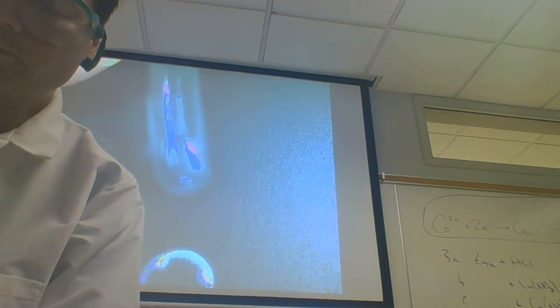And we're forming a solution of what? Cobalt chloride. Cobalt actually has a color to it. It's too hard to see here. Let me see if I put a white background on this, if we could see it better. No. Okay, it works. Black. Kind of blue. Yeah. It's actually purple. Can you see it? Here. Try it one more time.